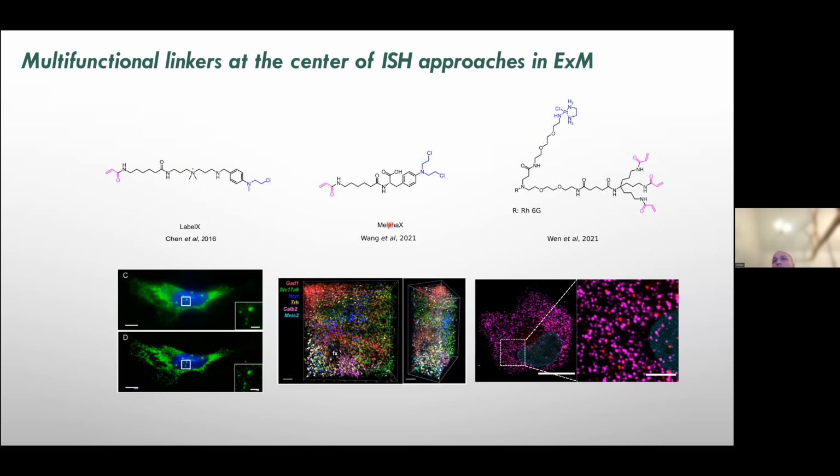We tested this variant of this where the carboxylic acid here is not present, and that works at least equally well, so it's not needed for the binding. It's probably mostly to do with the fact that there's here double nitrogen mustard, which increases the activity. And then this is our prime system, platinum-based and 3 acrylates.